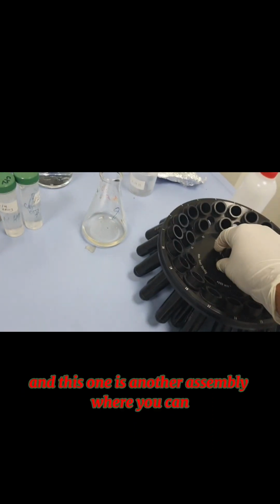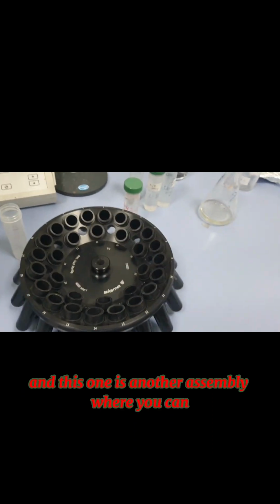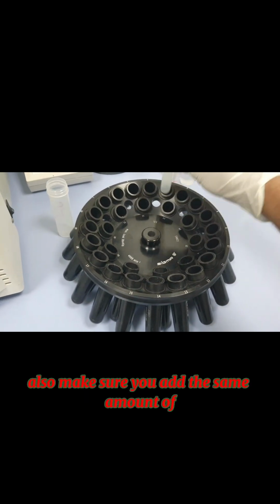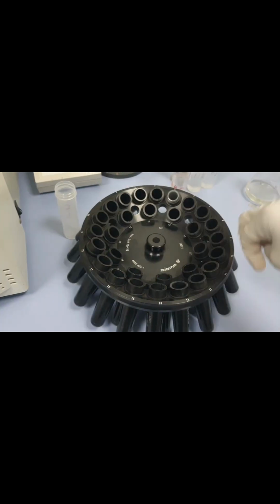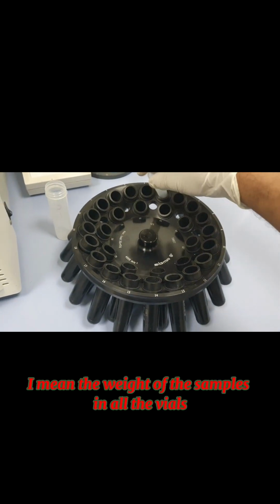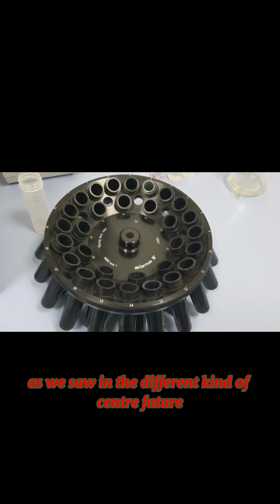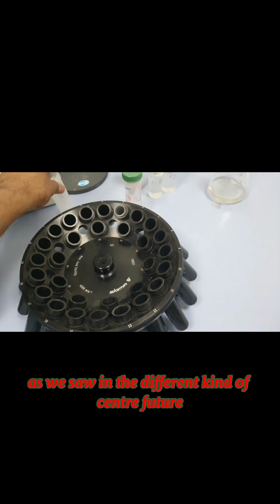And this is another assembly where you can keep these kinds of vials. Also make sure you add the same weight of sample in all the vials. If you don't, it will give you an error, as we saw in the other centrifuge.